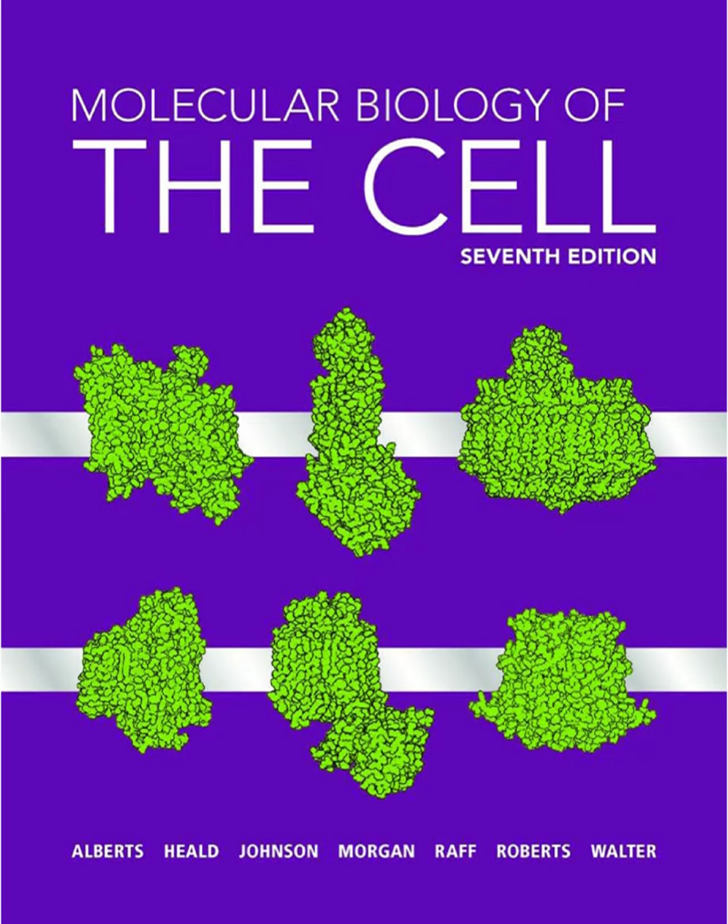Which brings us to the absolute cutting edge for structure. Cryo-electron microscopy, cryo-EM, particularly for single particles. You mentioned this briefly. How does it achieve near atomic resolution? Cryo-EM single particle analysis has been revolutionary, truly deserving its Nobel Prize. The challenge was always imaging unstained macromolecules. They offer very little contrast, and the electron dose needed for high resolution would destroy them. So how did they solve it?